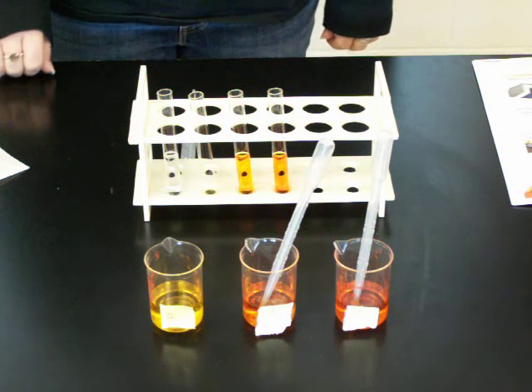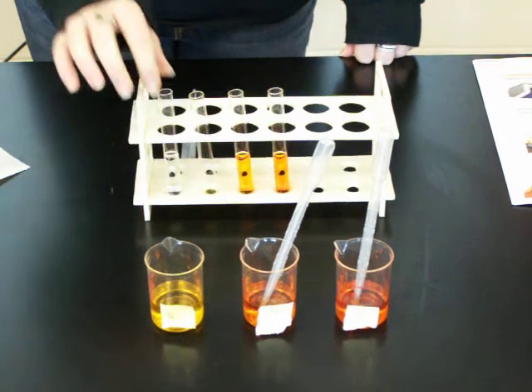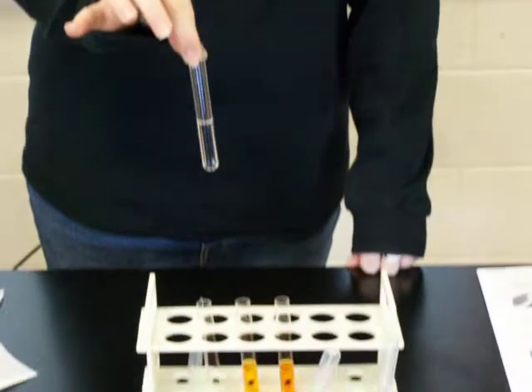All right, Miss Avent right now is going to use our sample of just water, which is called a blank, and put that in the spectrophotometer.